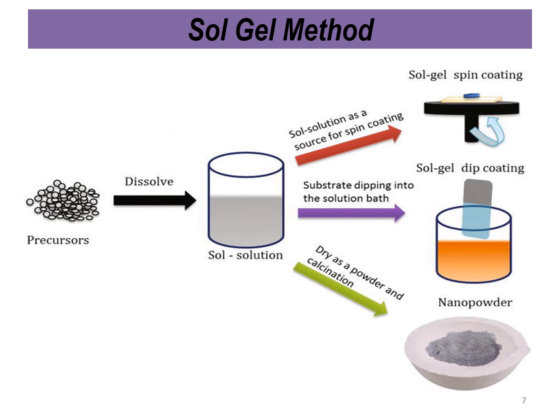In sol gel spin coating, whatsoever gel we obtain, we place the gel on the center of a substrate, and then we spin that substrate at a faster rate, and due to fast spinning of the substrate, the gelatinous material is uniformly distributed all over the surface of the substrate, and in this way we obtain a film of the gelatinous material on the surface of a substrate.